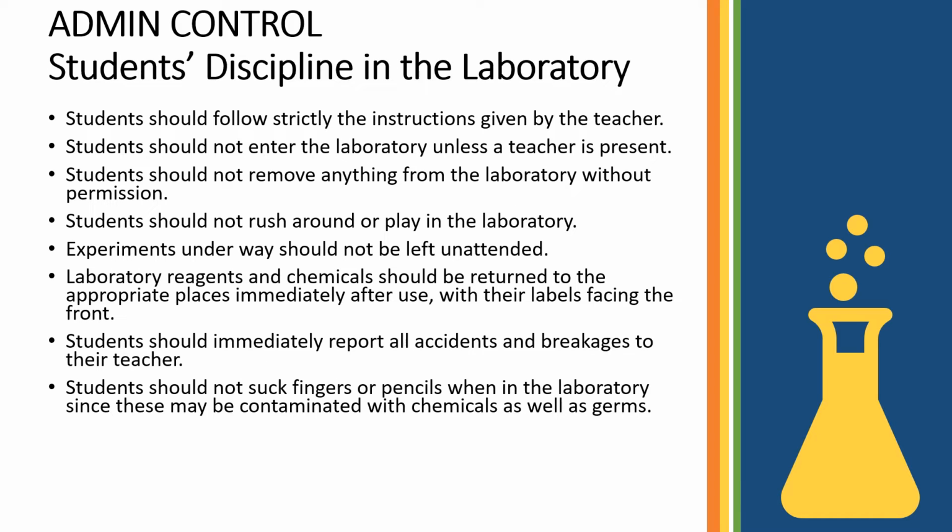Admin control, students' discipline in the laboratory. Students should follow strictly the instructions given by the teacher. Students should not enter the laboratory unless the teacher is present. Students should not remove anything from the laboratory without permission. Students should not rush around or play in the laboratory. Experiments underway should not be left unattended.